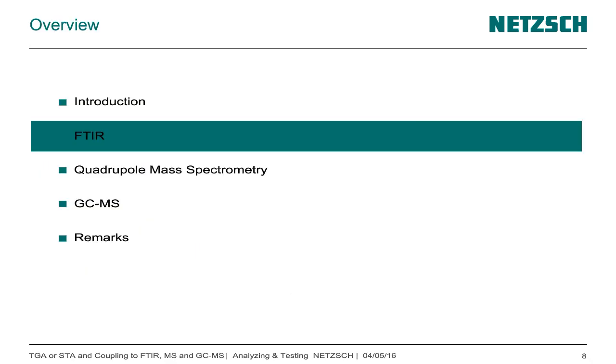So I first want to talk about FTIR. I think FTIR is one of the oldest, and from the history of my talk, FTIR, then mass spectroscopy and GC-MS, I think this is the right way to start.